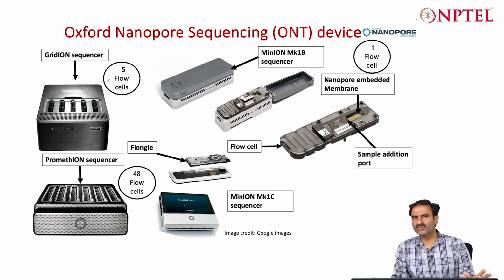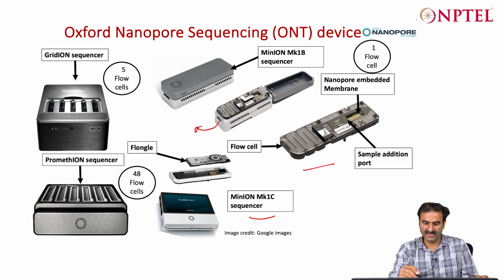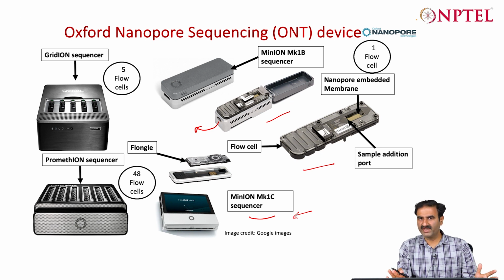Okay, and many types of nanopore sequencers are available which are very affordable, like this is MinION, and MinION MK1C. This is USB based, you can attach it to the system by this, and this one will be like 1.5 lakh per run, and this sequencer again you can get for 5 or 6 lakhs, the sequencer as well as the consumables, right?